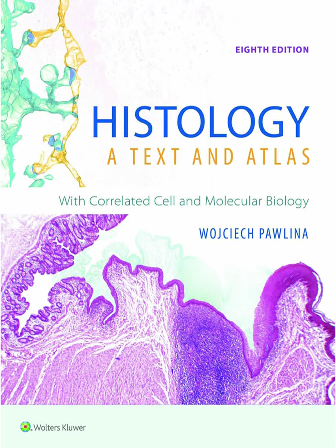Internal details. Got it. What's the other type? The scanning electron microscope, or SEM. SEM is different. Instead of passing through, a focused beam of electrons scans back and forth across the surface of the specimen. This knocks secondary electrons off the specimen surface, and these are collected by a detector to build up an image point by point as the beam scans. So it sees the outside. Yes, it produces these amazing, often breathtakingly detailed, three-dimensional looking images that show surface topography. Think of those incredible pictures of insects' eyes or pollen grains or the surface of cells. That's usually SEM. Right, those almost sculptural images.